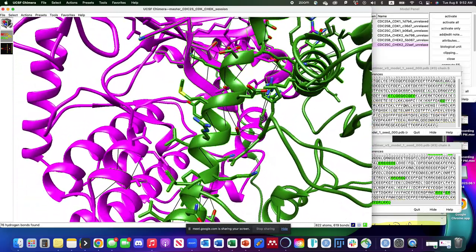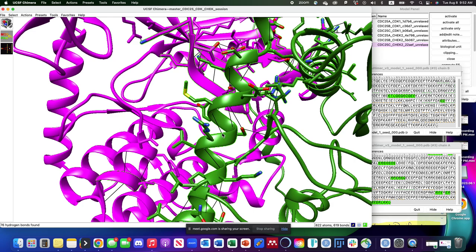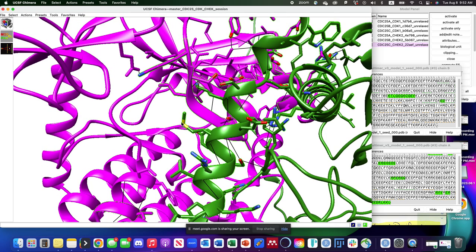So how do you know what are important ones? Well, anything that's in between the backbone residues, not important. There's lots of hydrogen bonding that happens in the backbone, because that's how the structure of the protein is formed. But what we're interested in are the interactions between the R groups, which are all these things that are pointing out. They're basically the group that does the action of the amino acid.